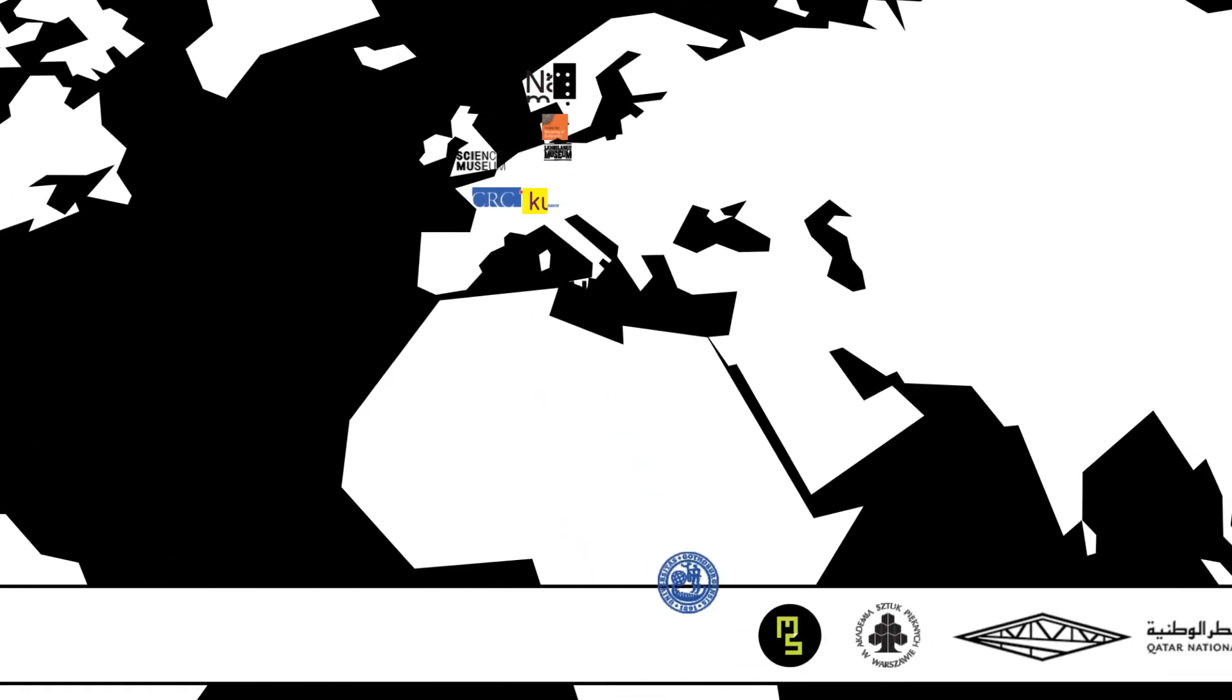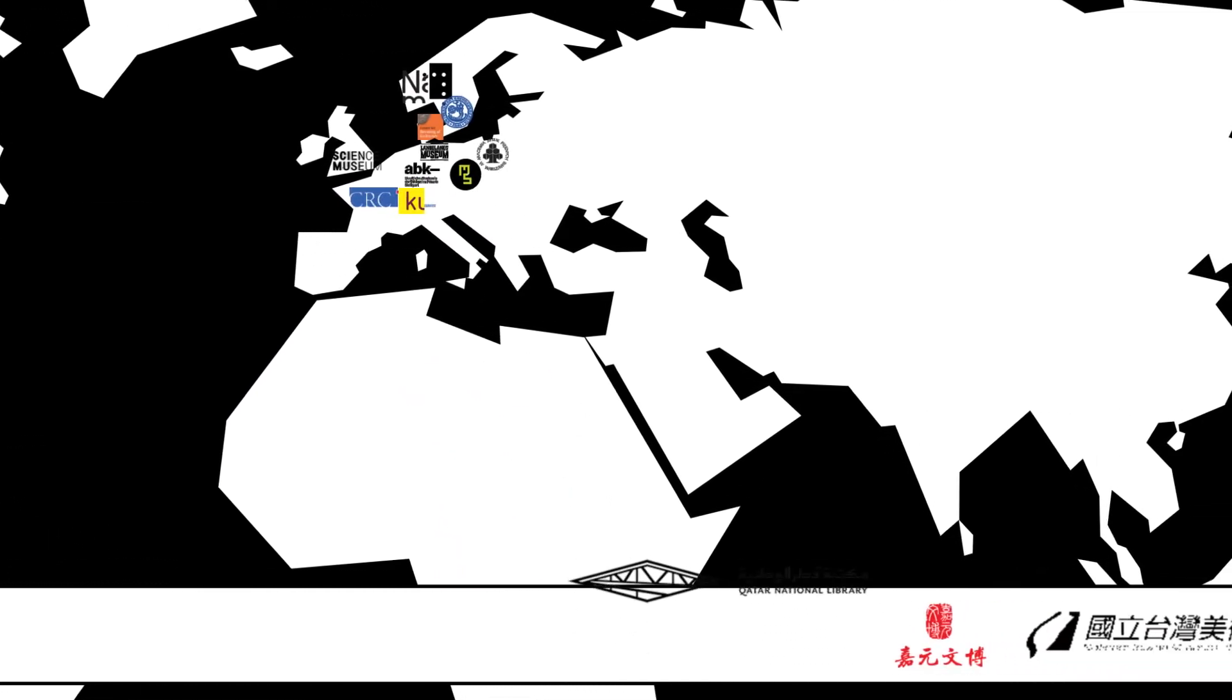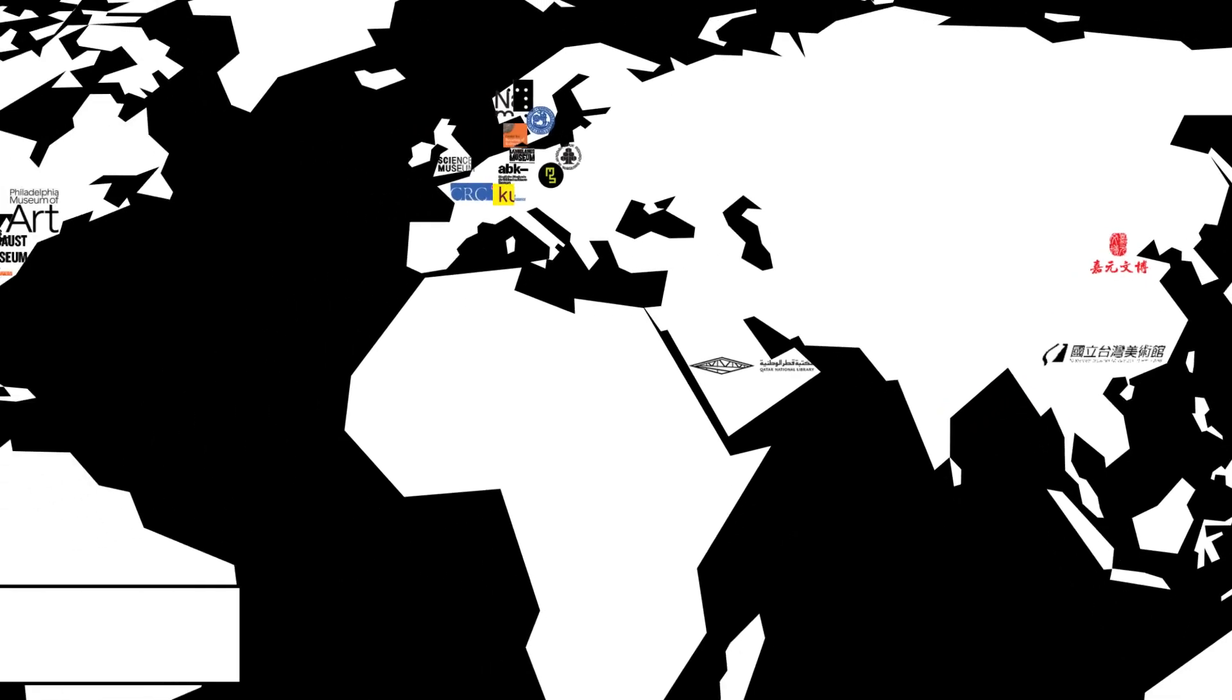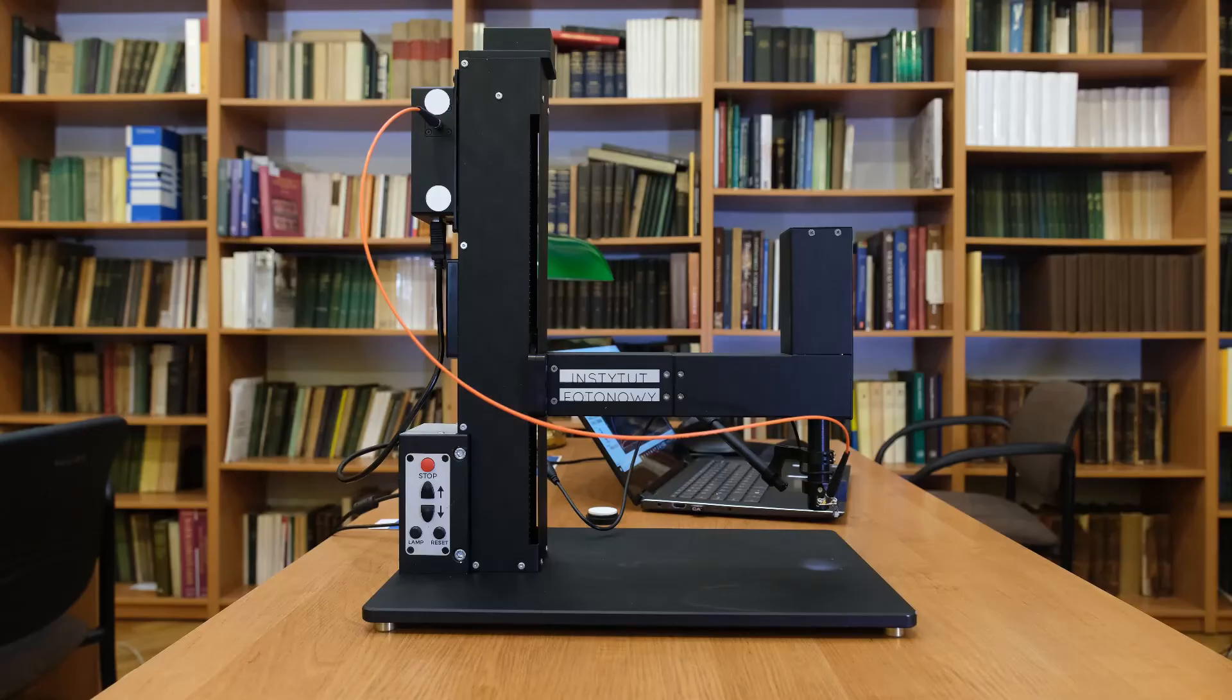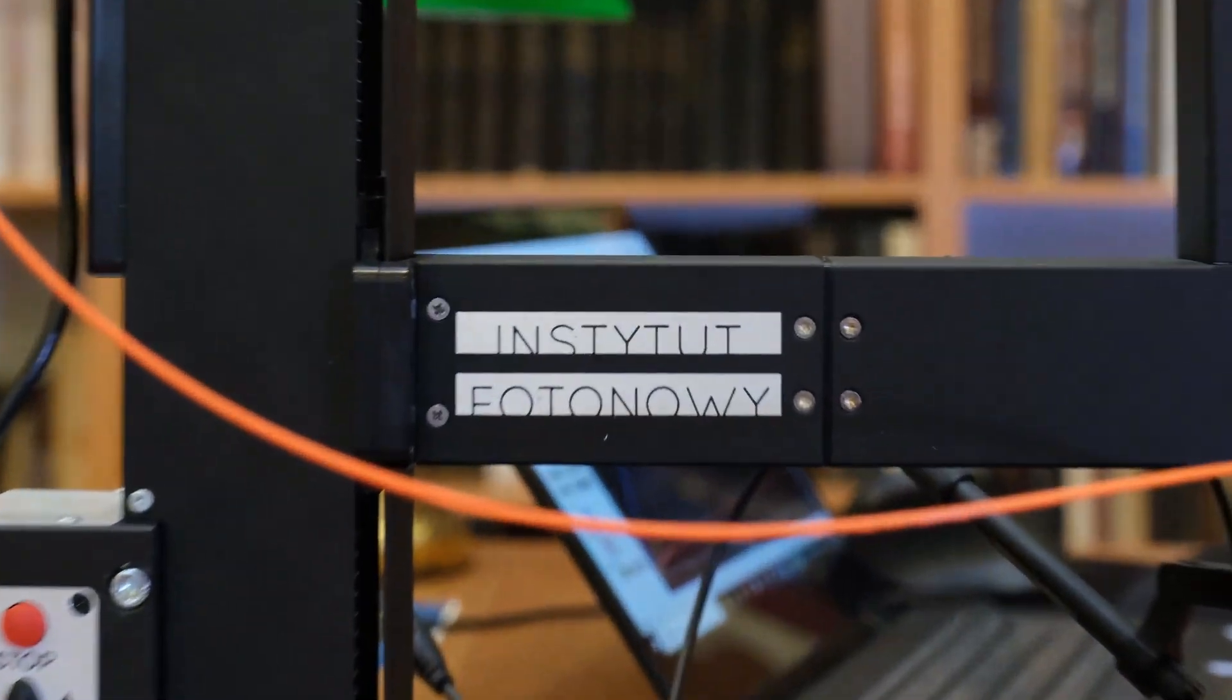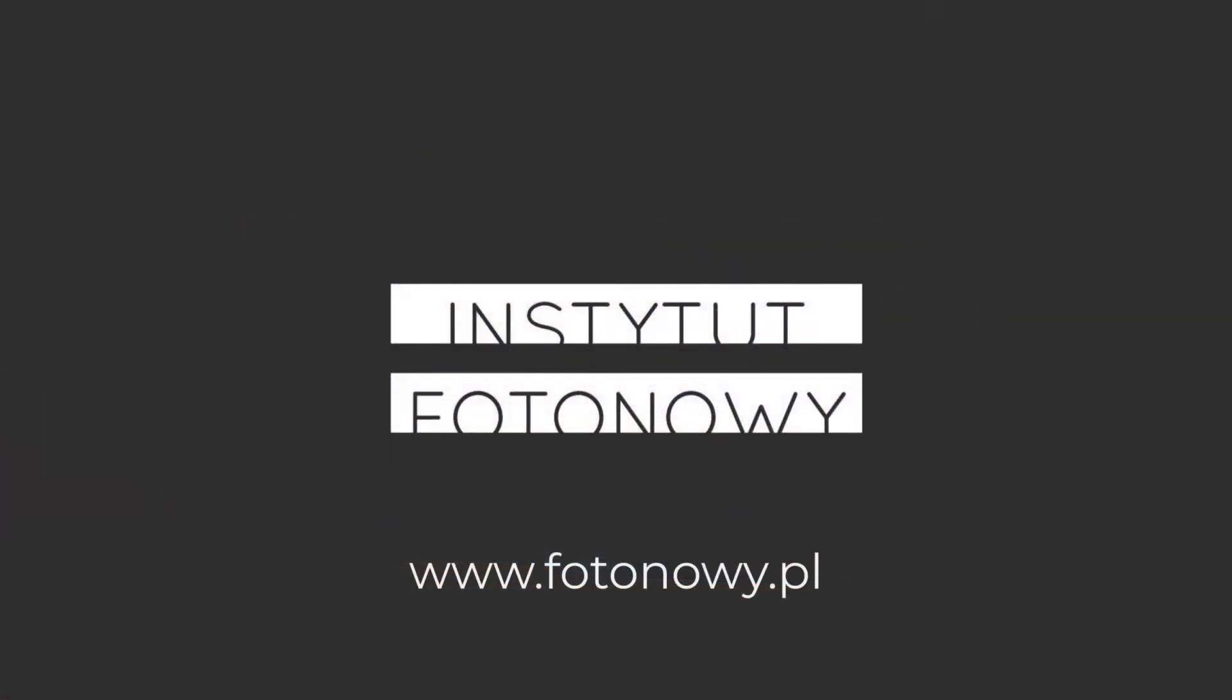A unique, automated, and user-friendly testing device for conservators and heritage scientists. Developed by scientists, not only for scientists. By Instytut Fotonowy. Microfading tester.